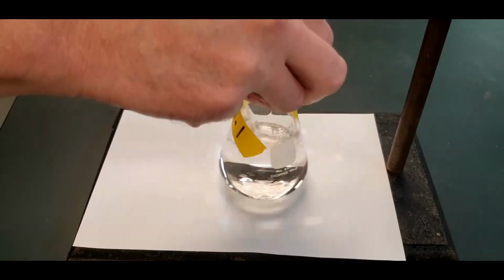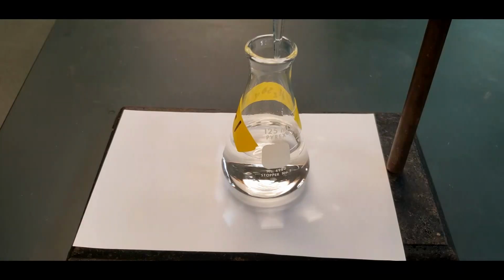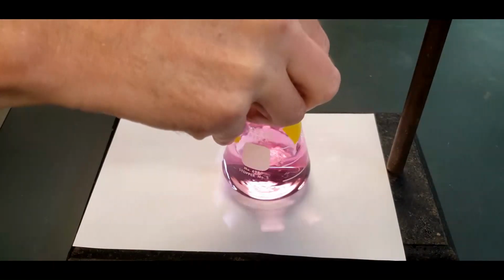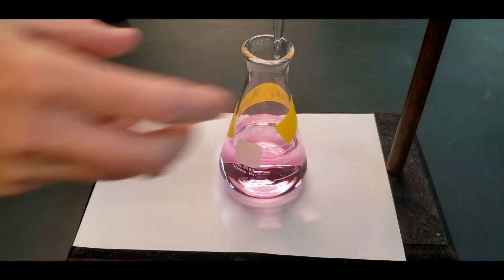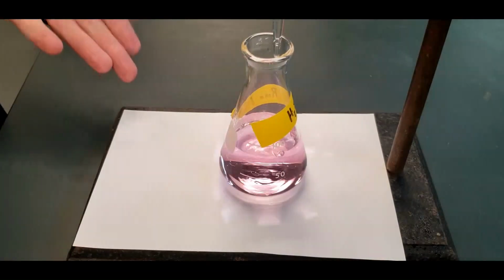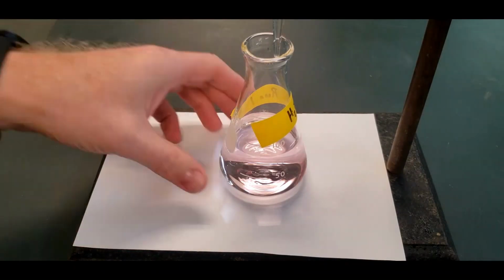So I'm going to just look at it for a second here. It is just below 32. Yeah, that makes sense. Okay, and then put in one more drop. And yeah, this time the color has stayed. It's very, very faint. That's what we want. So we're right at the end point. That looks good. So let me, I'll show you the volume here.